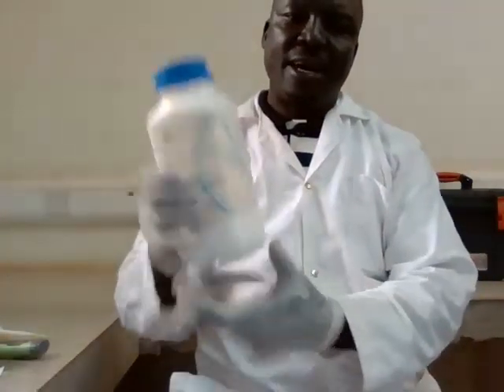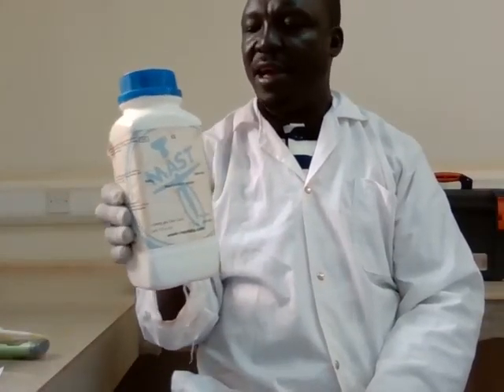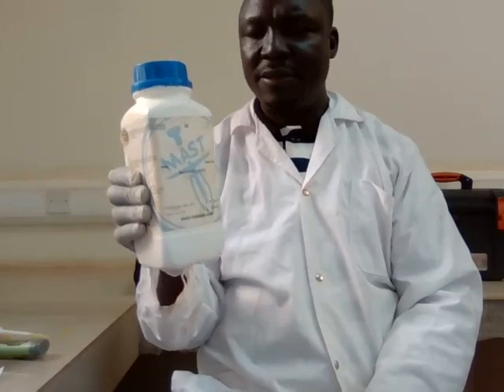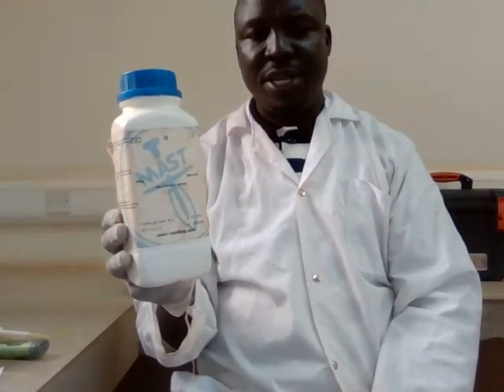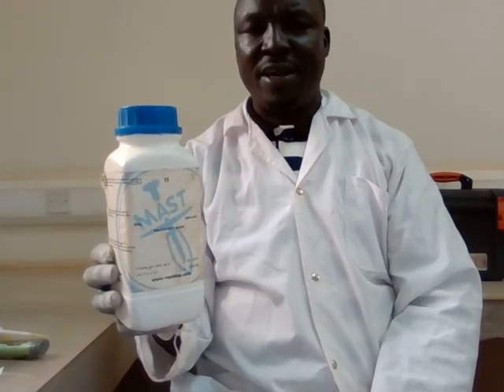So that is that for using the membrane filtration unit. And the next time I'll be showing you how you're going to use the agar media for inoculation of specimen on the surfaces, and then you'll be able to follow. I will also illustrate to you how you can do the weighing using our analytical balances, and then also I will show you some of the equipment that are not with me here. So thank you very much. I wish you all the best.